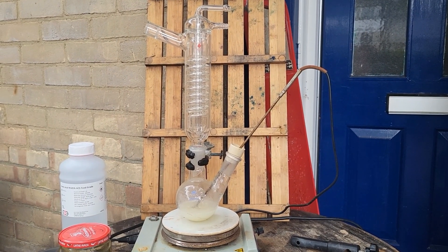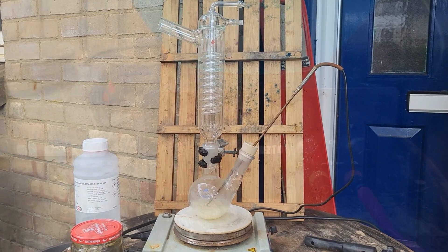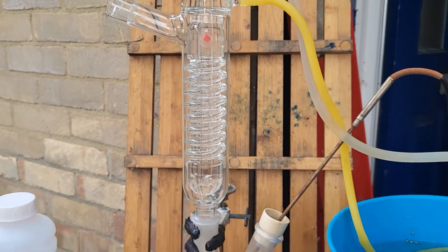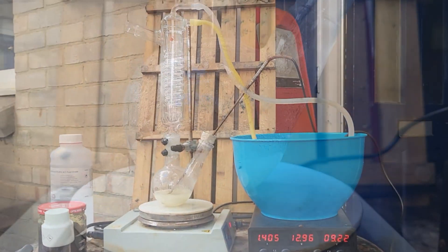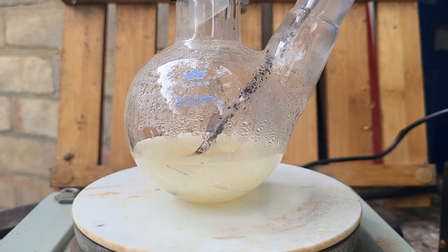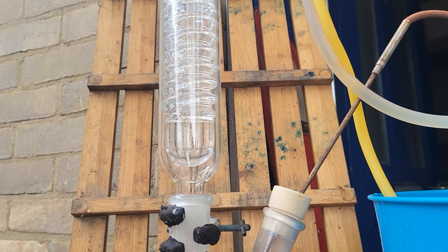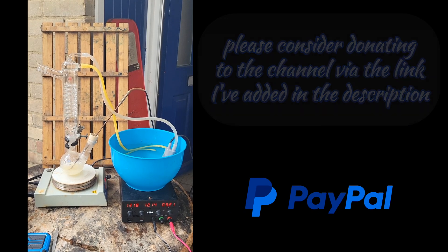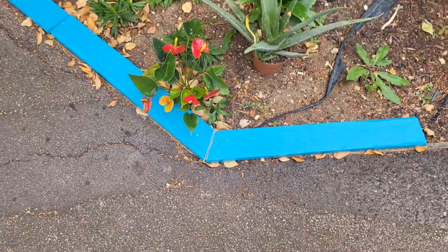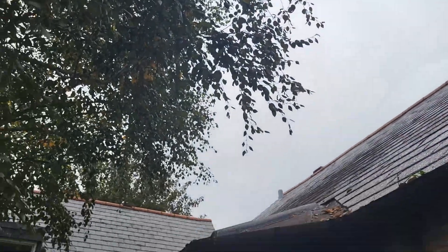I've added a better condenser and I'm going to heat this to 110 degrees. You can see the gases start refluxing. I do like this condenser — this is a highly efficient condenser. It looks like it's about to start raining. You can see it's just starting to boil.